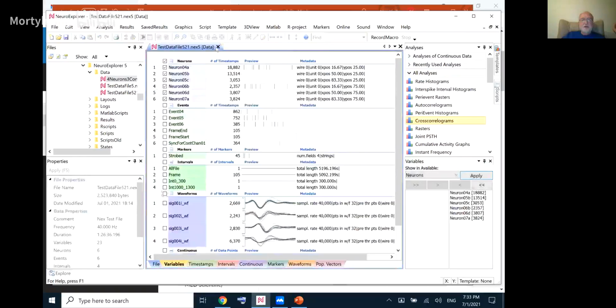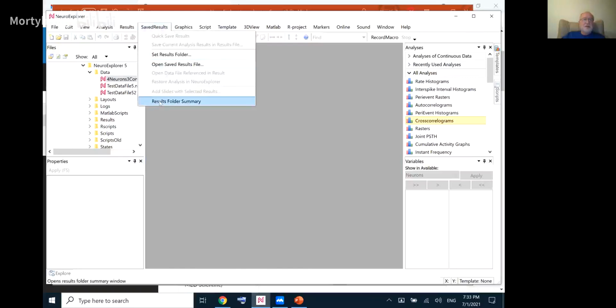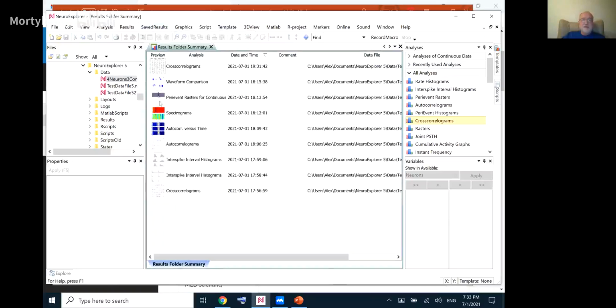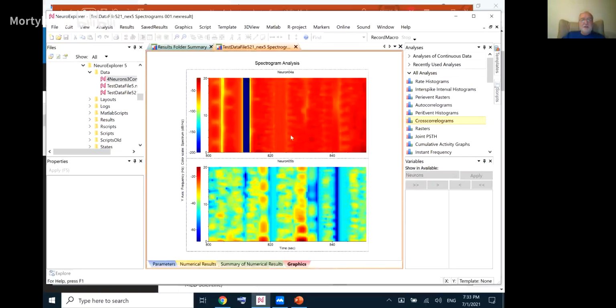If we close everything, you open the program and you want to restore results that you saved and make them live, like live analysis. Open this one, right click.